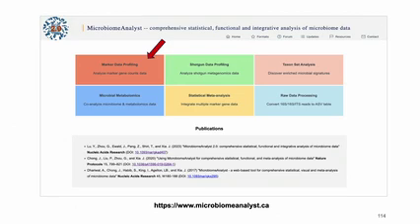So we want to know what's the different microbe species between these two groups, and if there's an overall different pattern between these two groups, and the dominant species, and if there's correlations between these species. That's what we will get to know after analysis. So we'll start from here.